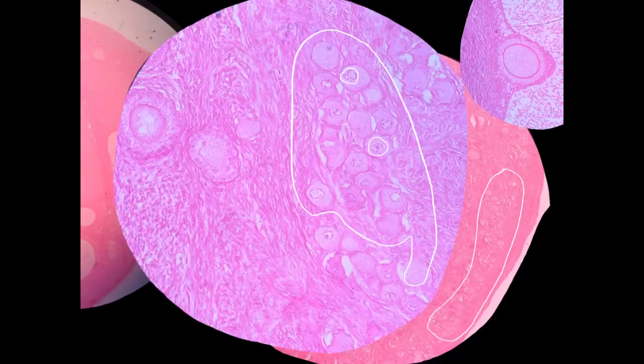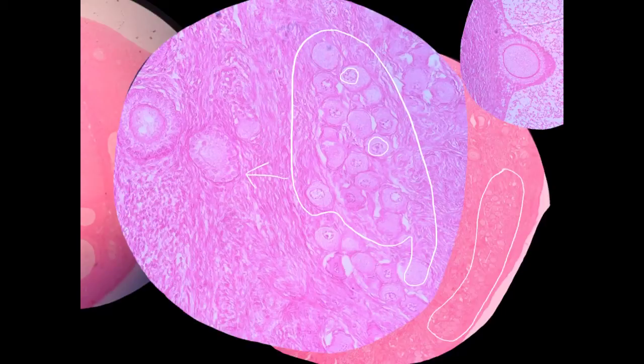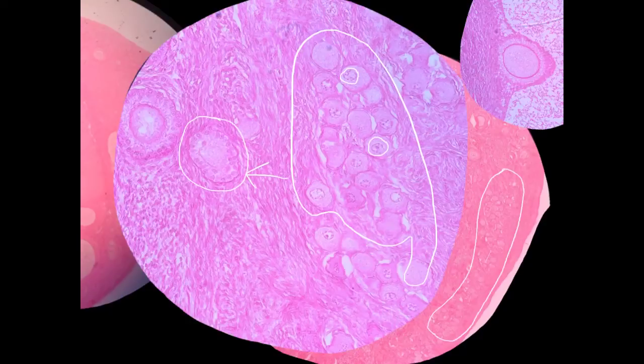Eventually, these cells grow and develop into something like this. This one is a very small secondary follicle.